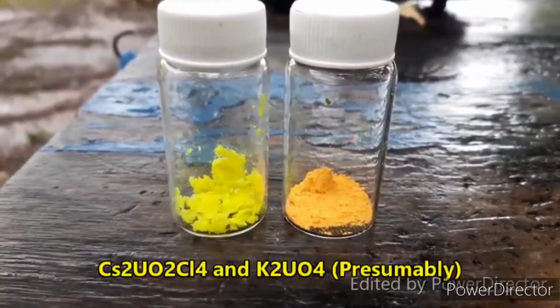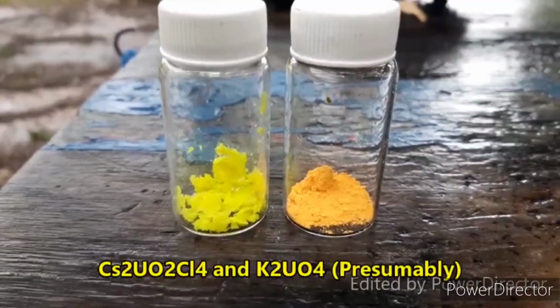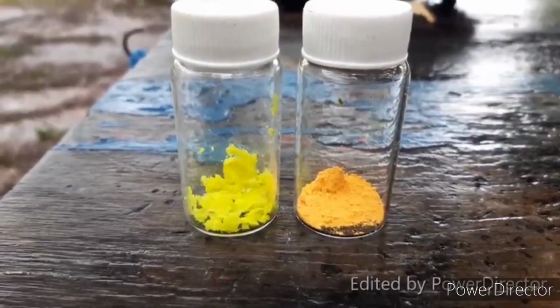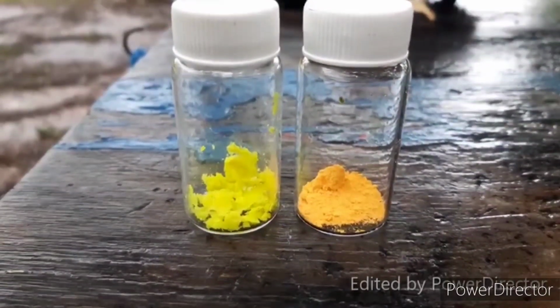Okay, everybody, here are our final products. We have the cesium uranyl chloride and the potassium uranate. They look beautiful under the scope, as much as I can see, so I think both of these were successful, which now we have a much better way of making alkali uranates than we had before. So that's pretty goddamn awesome. So special thanks to the uranium dude who came up with the idea of using nitrate. Although the idea to mix it with the chloride, that was all mine, although that's hardly some great intellectual leap there.